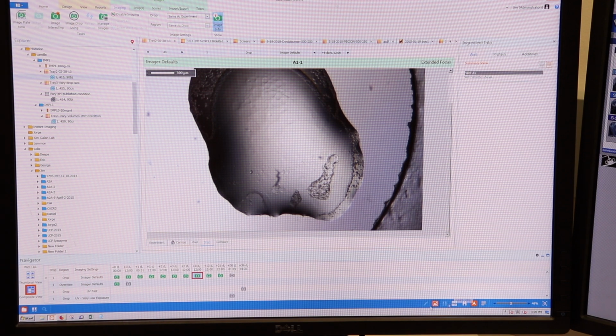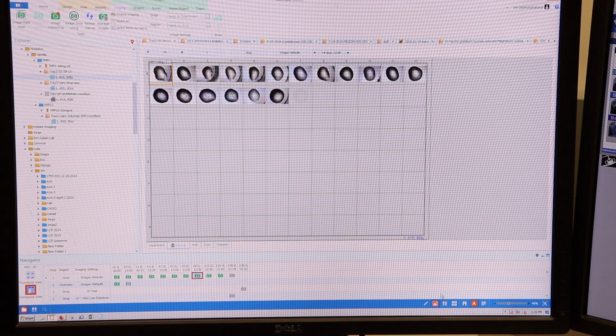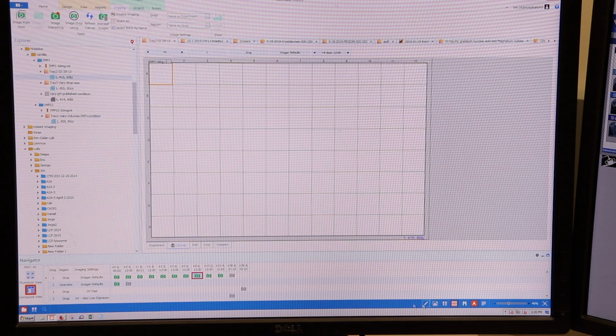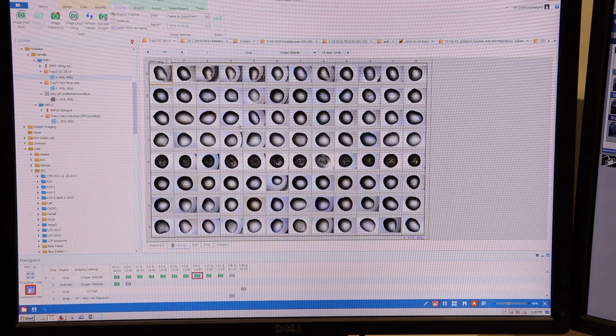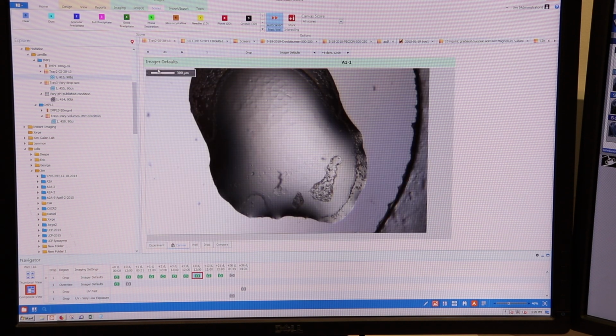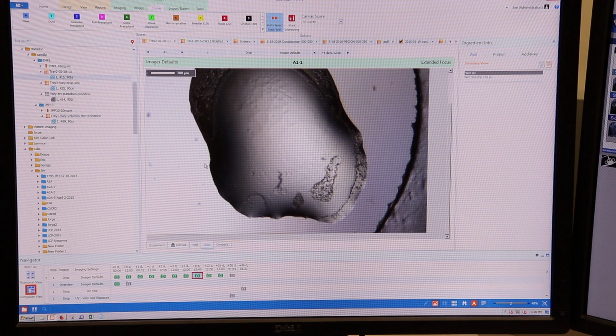Or if you hit score view on canvas, so that's not a good example. Image view. Under tool, scores. Under scores, you can use the keyboard and keep track of what you have here.